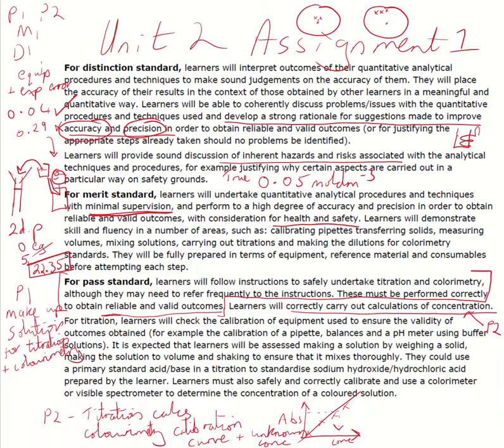What else would I do? The chemicals you're using, look up the safety of them. So for example, are they corrosive? If they are, then what steps have you taken to minimize the inherent danger to yourself? Easy one here, well, we've got some PPE on. We've got safety glasses and we've got lab coats. So make sure to do that for each of the chemicals.